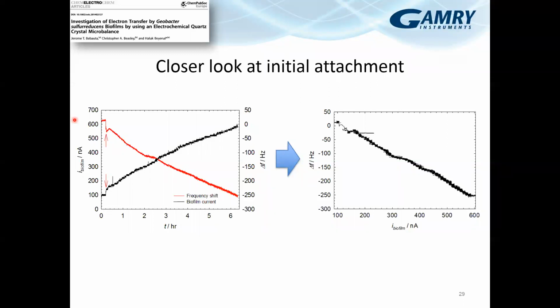Or if you really need to completely remove that effect, you can work on some kind of floating tables. These are tables that have a pneumatic system in the legs, and they're essentially floating. You can think of air hockey, if you're familiar, but essentially that.